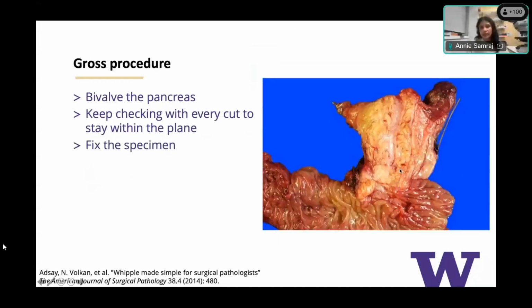Okay, so in an ideal scenario, this is what it would look like. Here, the larger structure is the bile duct, and this smaller structure here is the pancreatic duct. And here, you can see there is a tumor. And it is at this point that the specimen is fixed. So yellow, again, shows the bile duct, and green shows the pancreatic duct.